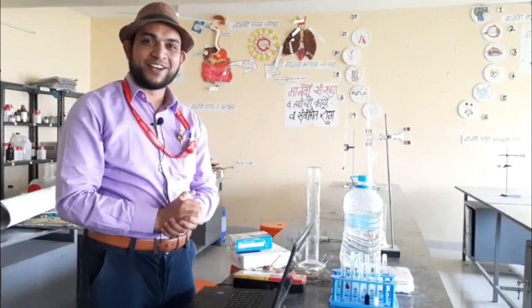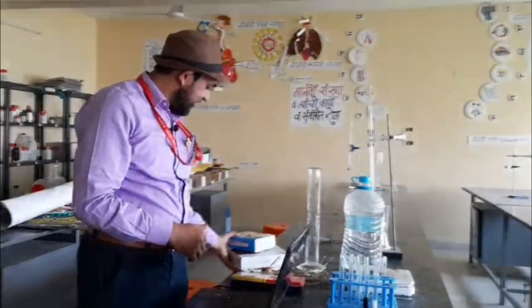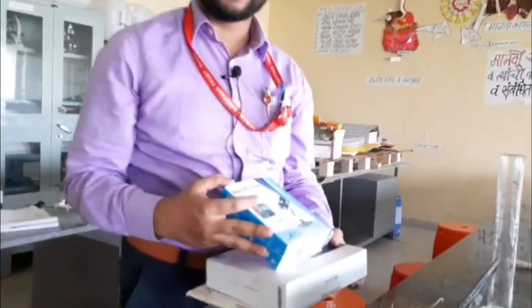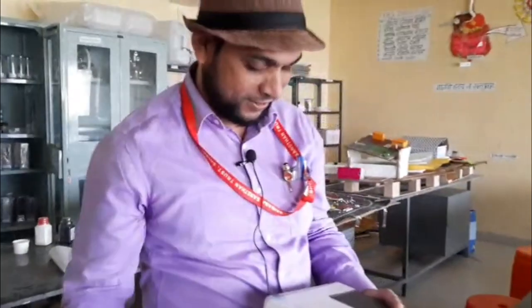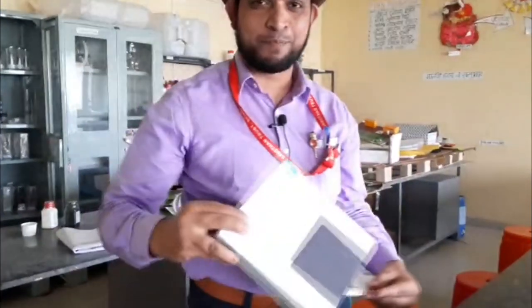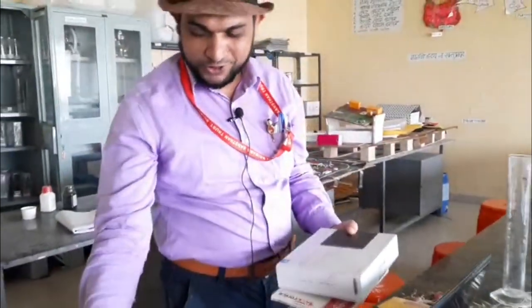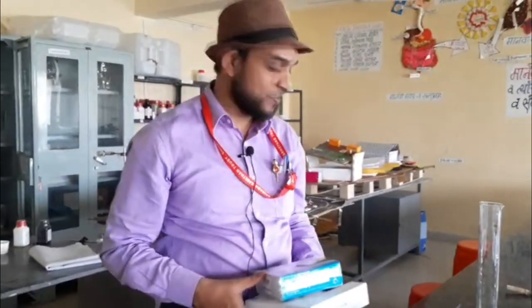Hello and welcome, dear friends, teachers, and students. Today I'm going to show you three important and very beneficial gadgets which are useful for research, teaching, learning, making notes, and other purposes. This is the digital microscope, this is the digital writing pad, and this is the digital notepad. First of all, I will show you the digital microscope, which is useful for research, learning, and teaching.